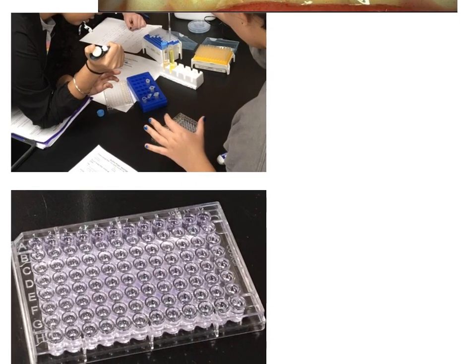All right, so now we'll get into the lab. Fortunately, I have some pictures from years past of what this lab looks like, so we can go off of those. But in this lab, you're going to be using a 96 well plate. We use those a lot in this class. This is what one looks like, and you can see up here for scale purposes how small the plates are.